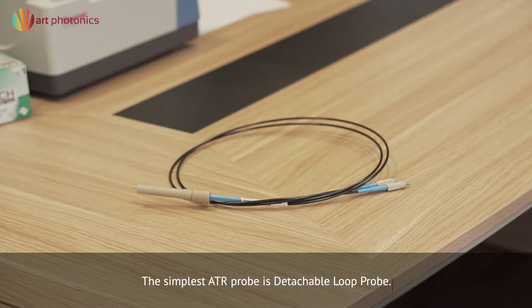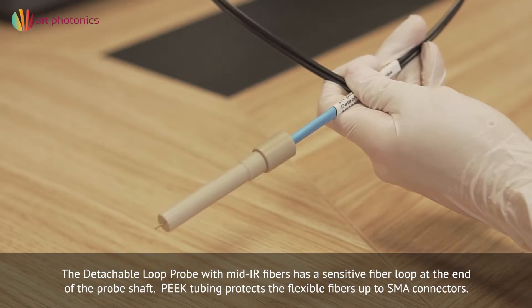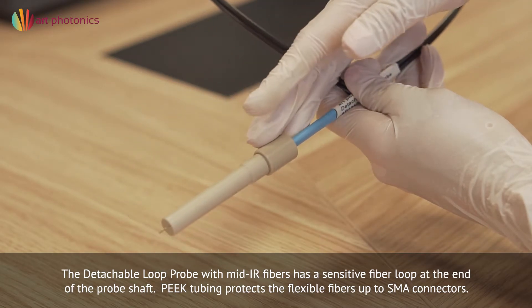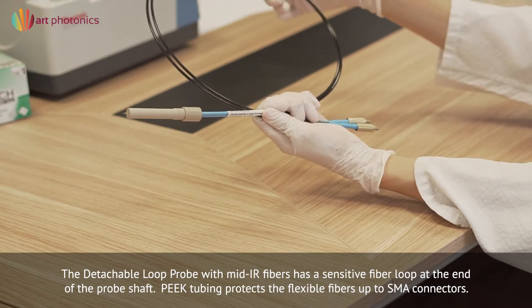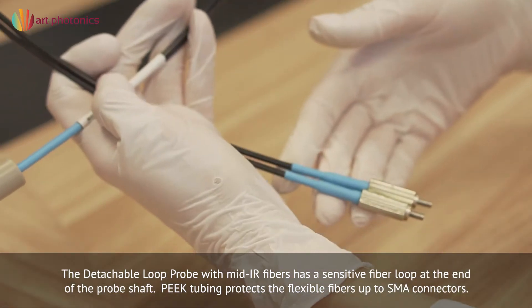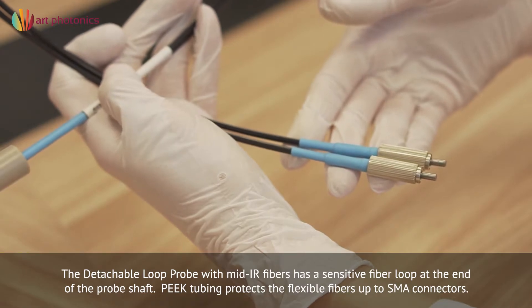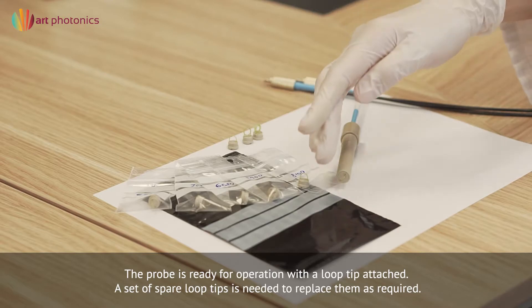The simplest ATR probe is the detachable loop probe, assembled with mid-infrared fibers. The sensitive element is a fiber loop at the end of the probe shaft. Peak tubing protects the flexible fibers outside of the shaft, and the fibers are terminated with SMA connectors. The probe is supplied ready for operation with a single loop tip attached.